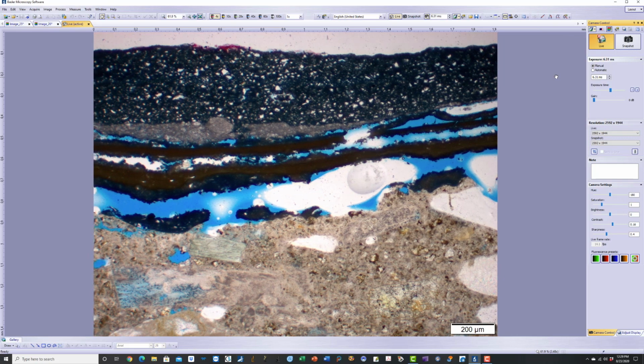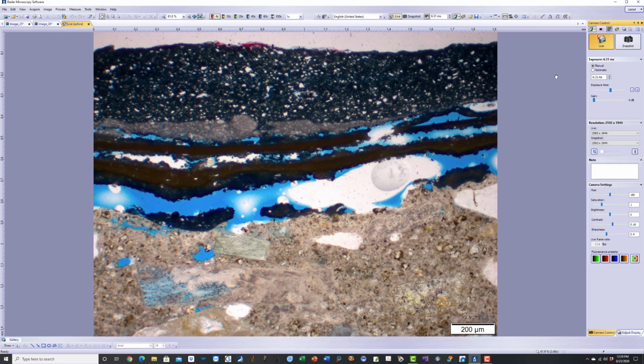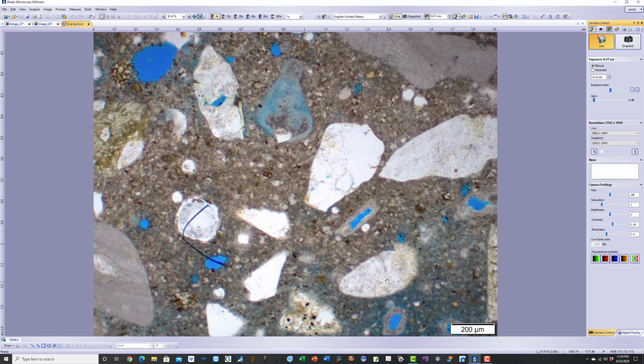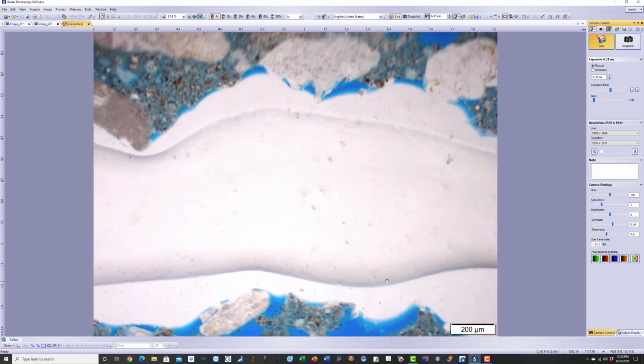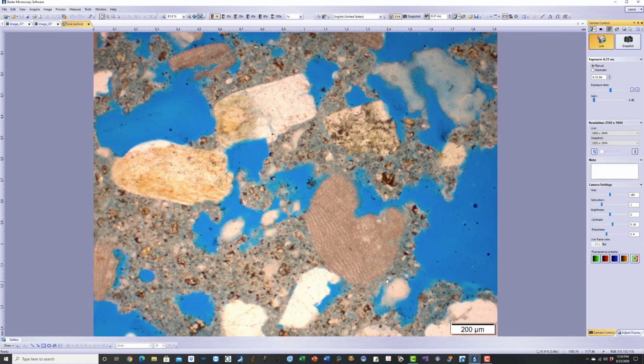Usually I use a gold coating to do the SEM observation. Here you can see you get a large area in this camera to be covered. This is at 4x, of course. This is a 4x objective. So you can see the paint layer and the denser portion of the mortar coating in one. Usually I take one, then another overlapping, two, about three, four, like that. Multiple sections I take like that to stitch to get a continuous profile from top to bottom.